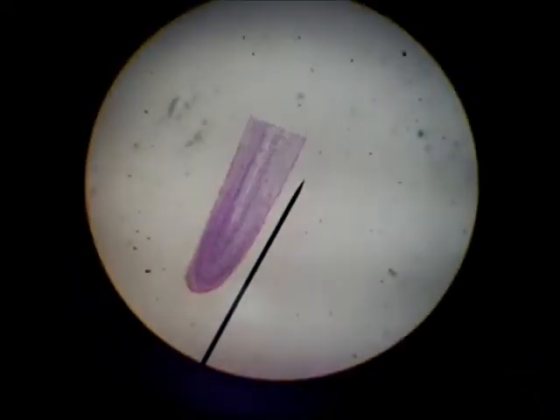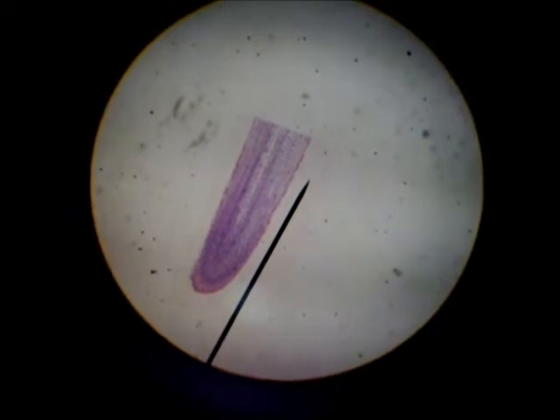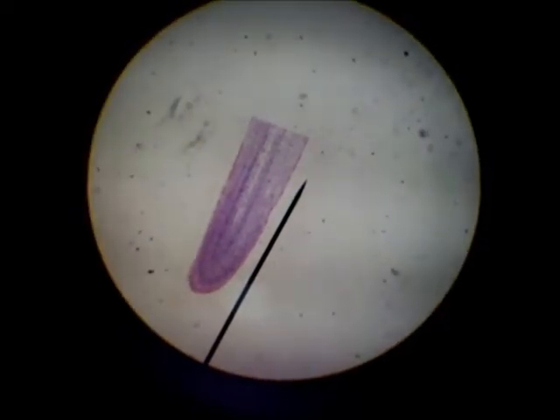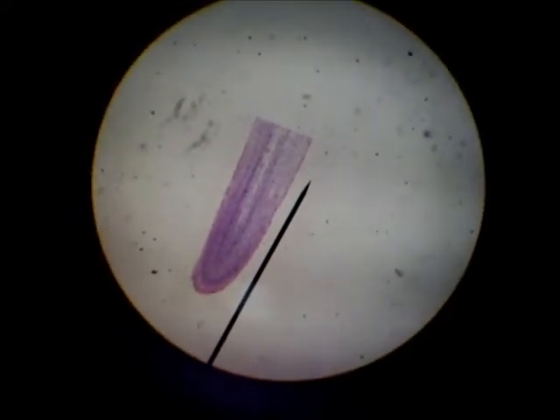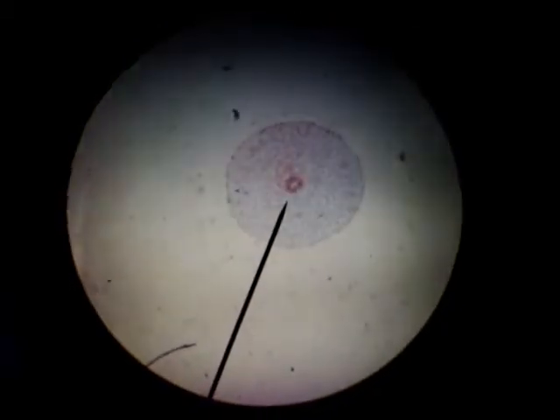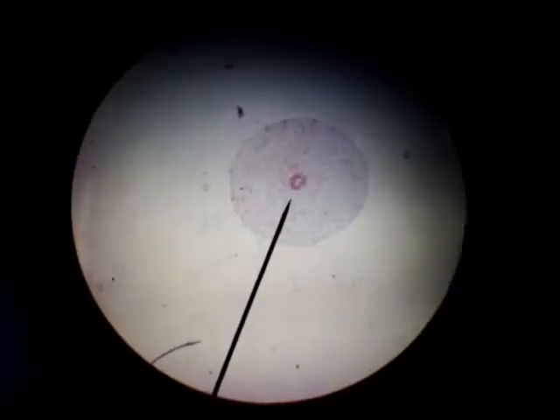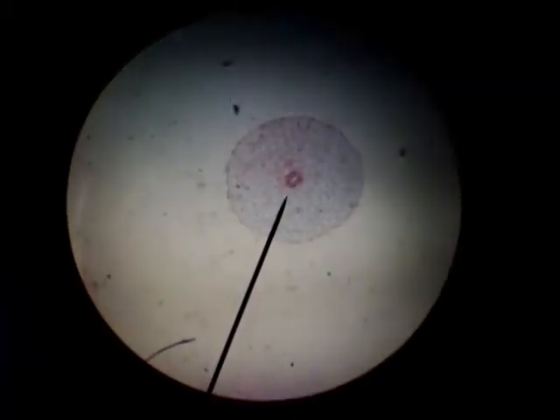This is a root tip of an onion plant. This is a cross section of a root.